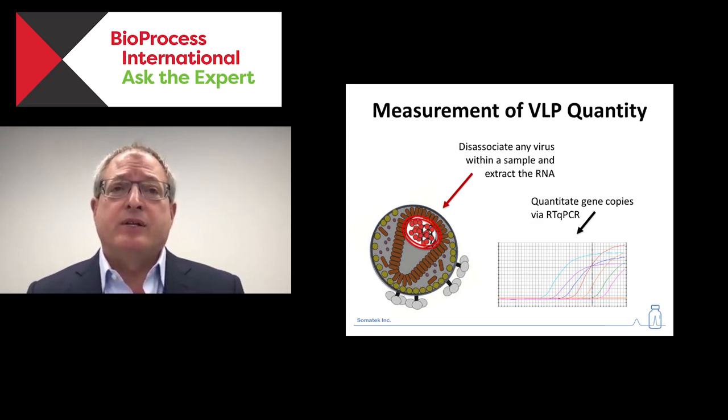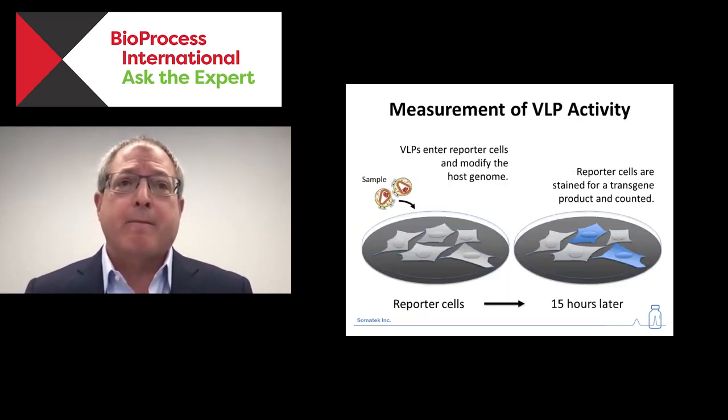Retroviruses are RNA viruses, so there's a reverse transcription followed by just standard thermocycling and quantitation. Little cartoon here shows a conventional qPCR output, but we did a lot of this work using Bio-Rad's digital droplet PCR equipment. And the data was the same. So this is how we could tell how much of our product was present.